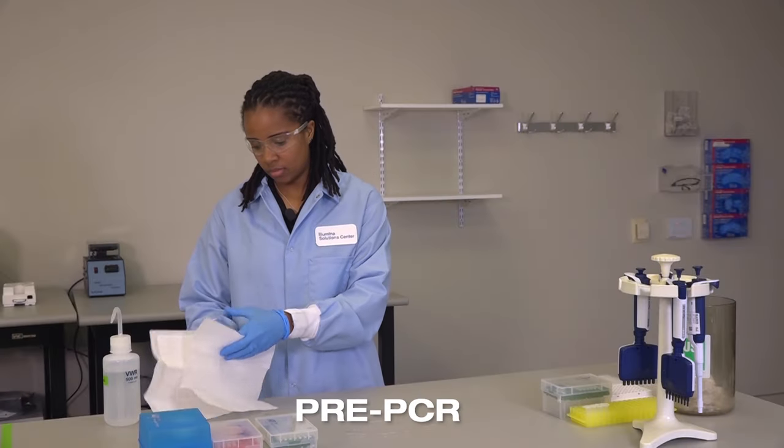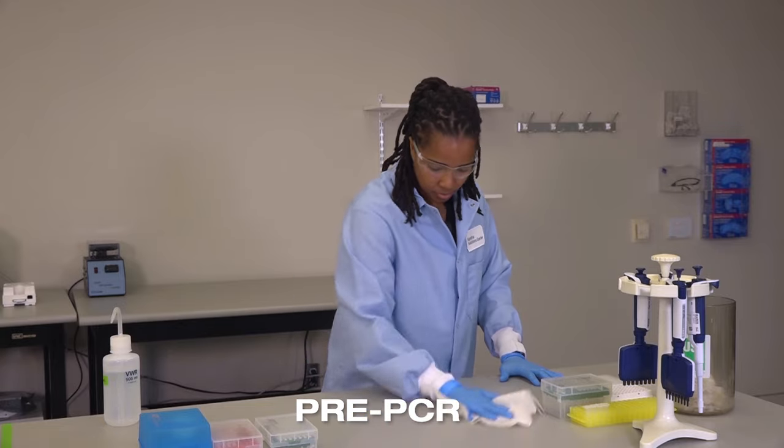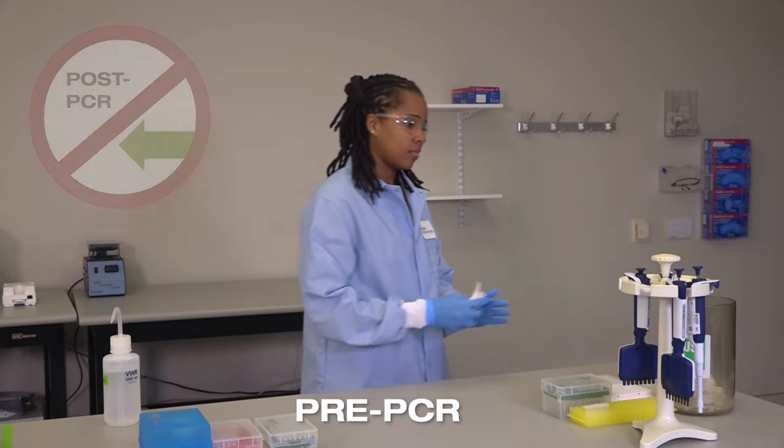Also, strict cleaning schedules need to be maintained, all of which we will discuss in greater detail shortly. Basically, the separate areas should be treated as though they are separate rooms.